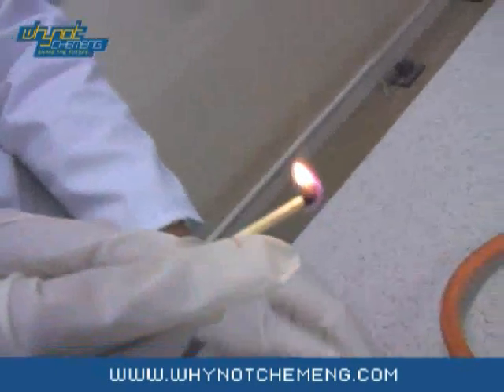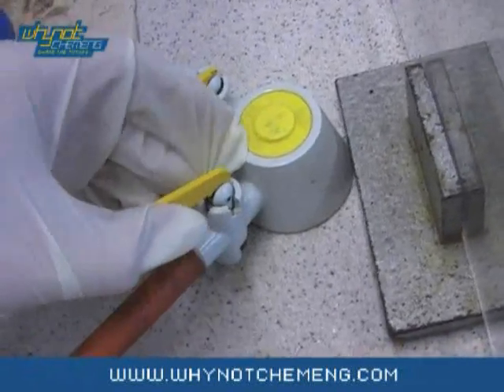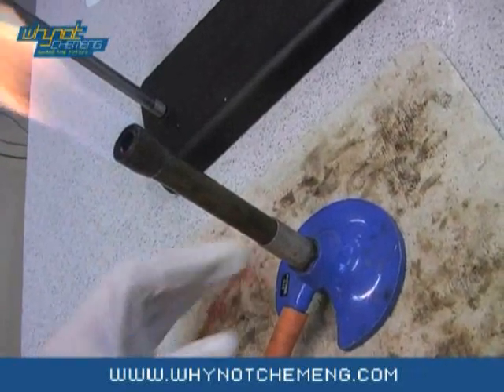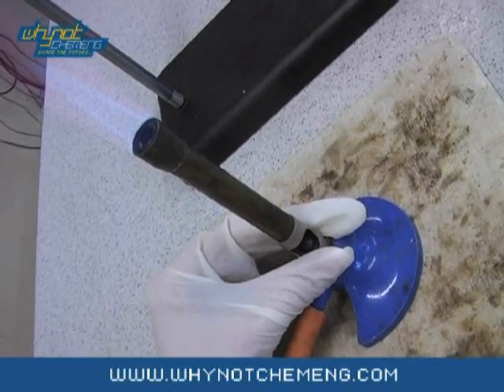Light the Bunsen burner, ensuring that you have a safety flame first, and then turning around to a roaring flame.